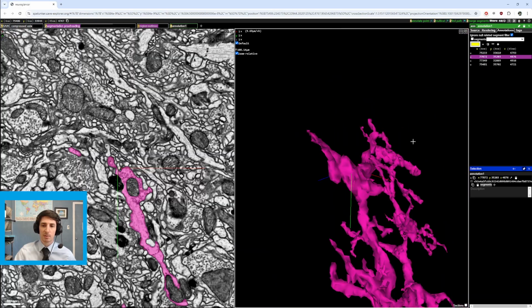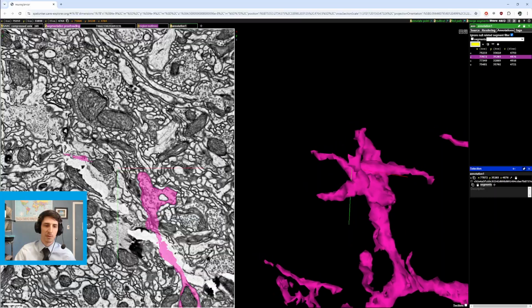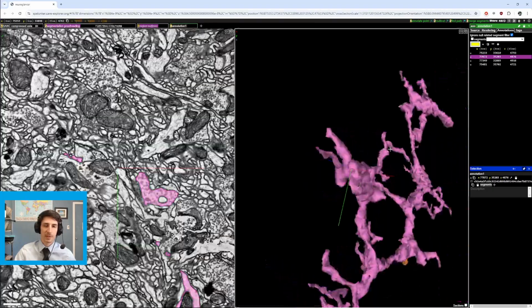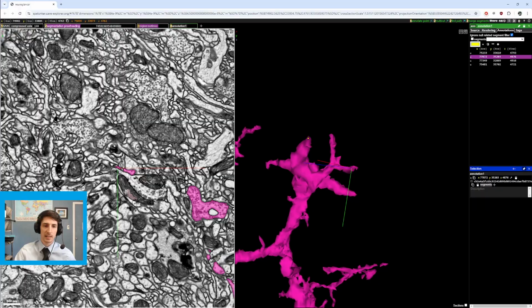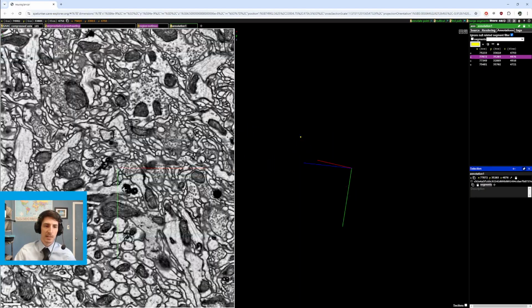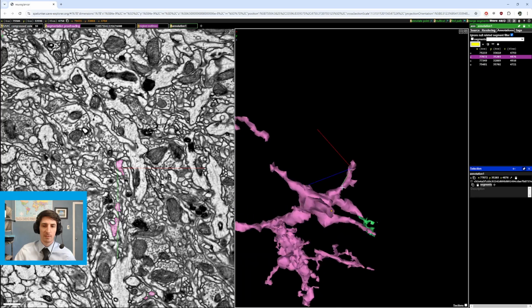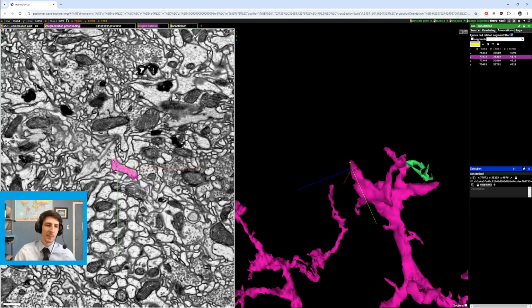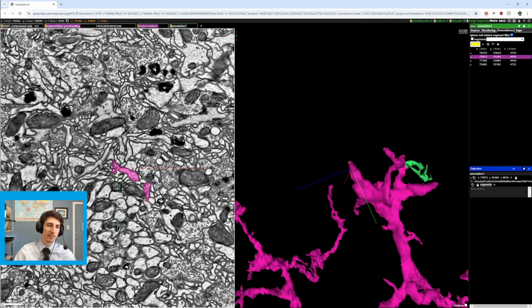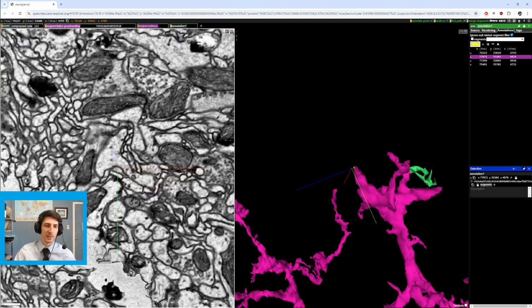And now we have this sort of branch amalgam that if we scroll through, we can see that there's a few options. There's this one, which is negative, that one, which looks like it continues a bit, but not too much. We have this, you can see my annotation point, you probably know where this is going. And then we have here. Here you can see this error was probably involved in the disconnection of this, but we don't know why, but this is a pretty clear connection. We're going to click that.